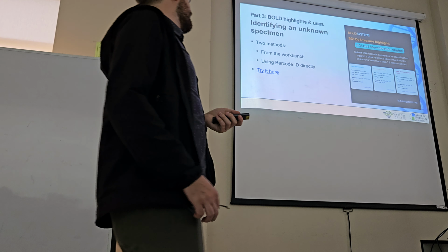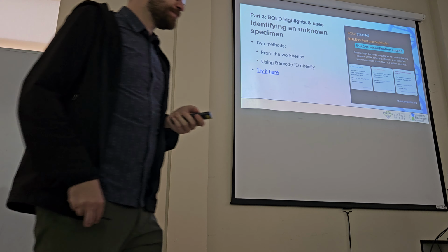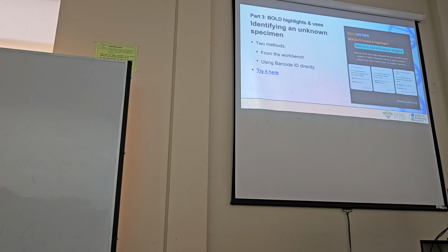So now we will try using the barcode ID engine. Okay?